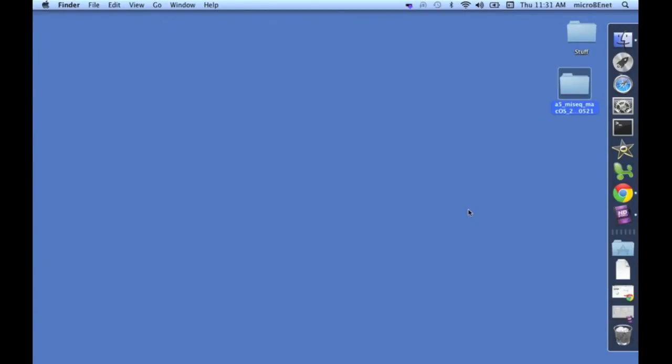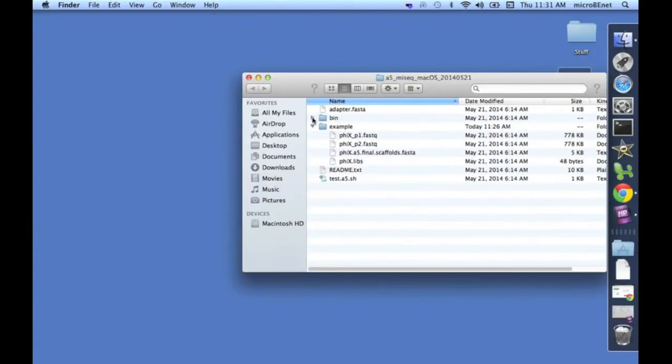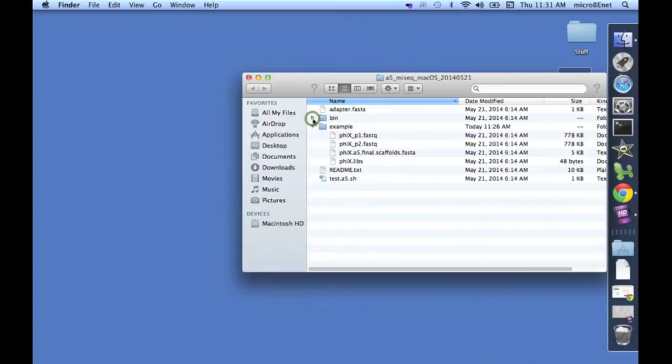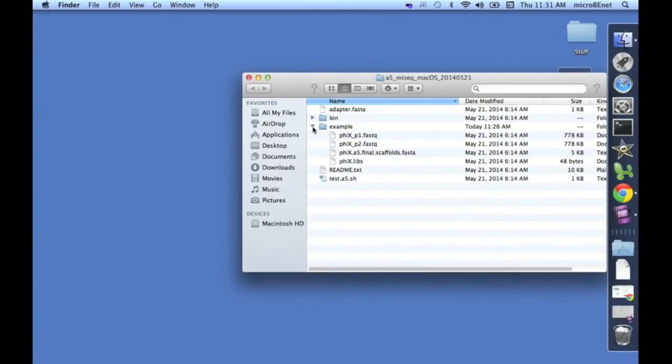First, let's take a look in the folder itself. Here in the bin folder are the programs that A5 uses to perform all the various steps required. And here in the example folder are some test reads from the Phi-X bacteriophage, and that's what we're going to use to make sure everything is running okay.